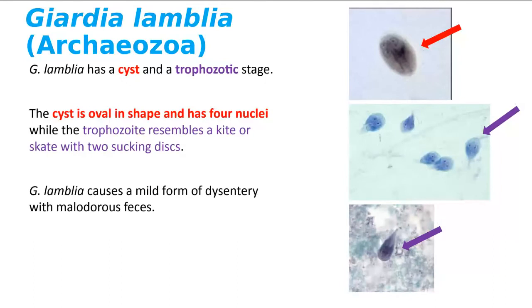The second organism in this group is Giardia lamblia, an enteric parasite. If you see all this debris in the background, that means it's a fecal smear, and you can say it's dysentery. If you're ever lost and not sure what it causes, most of the protozoal parasites are going to cause a form of dysentery.